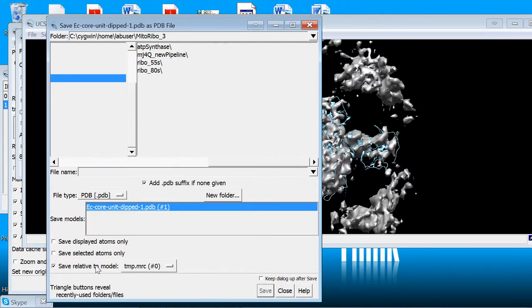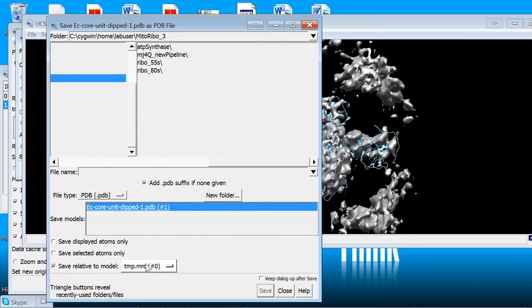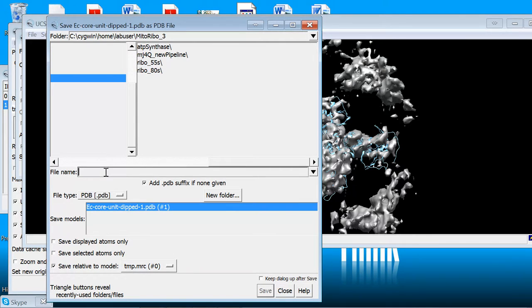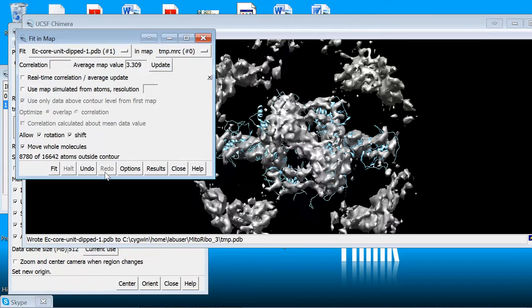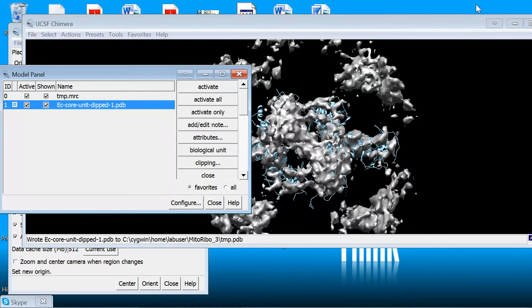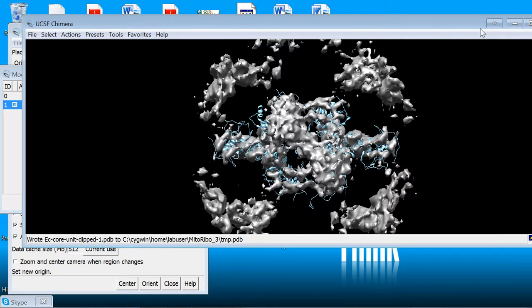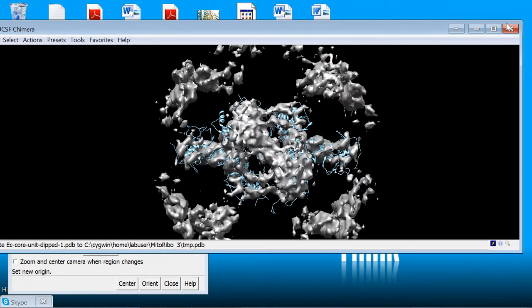And really critically, save it relative to the model that you've already saved. And I'm just going to write this out with the same prefix and call it temp.pdb. And that's really it. So now I'm going to exit out of Chimera.